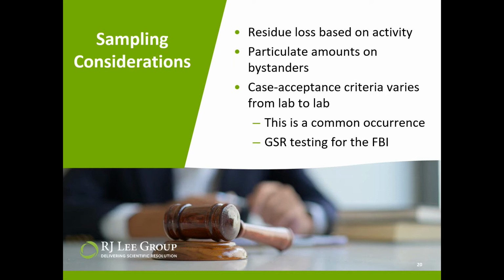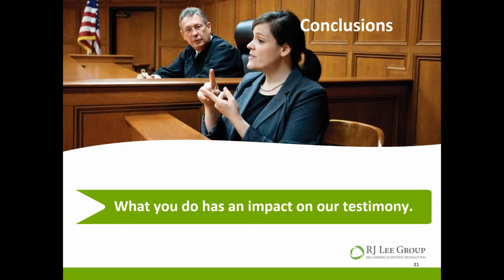So the FBI does not take gunshot residue cases anymore, but they do send them out to agencies like RJ Lee Group to analyze for them. So overall, the choices that you make and the way you conduct your collection is very important. It makes your testimony and our testimony so much easier when we can get in there and say, yes, the correct method was used to collect these samples.